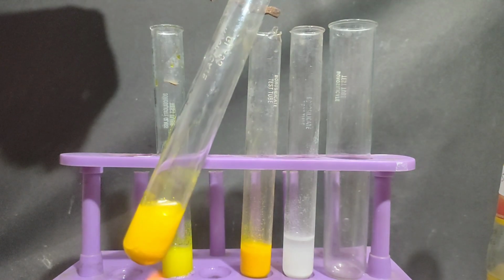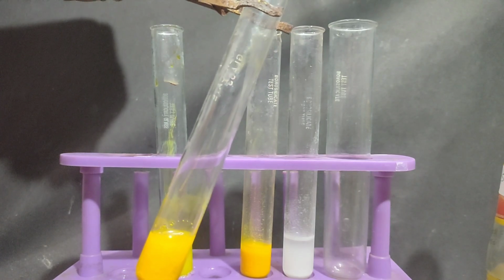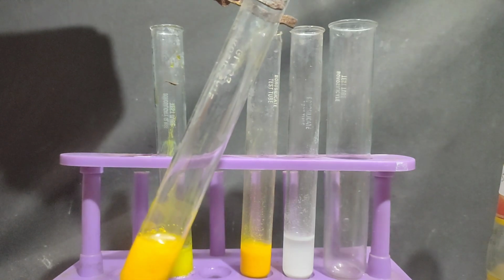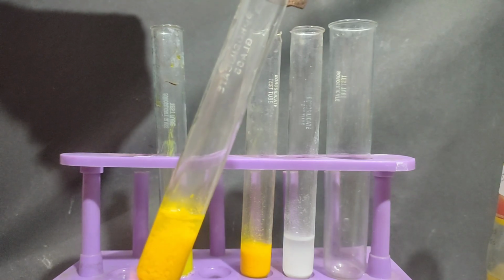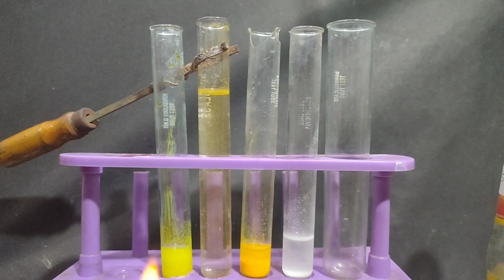This precipitated lead iodide is also soluble in hot water, so I'll be heating it to dissolve all the precipitate formed. In this case some more water also has to be added. Lead iodide will dissolve in hot water, and when it is cooled it will separate out as golden rain.